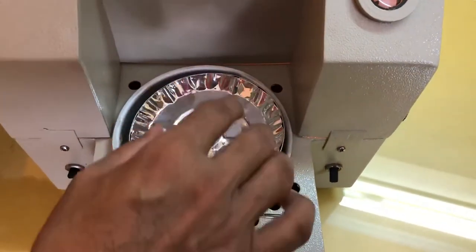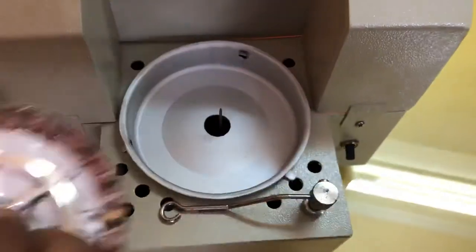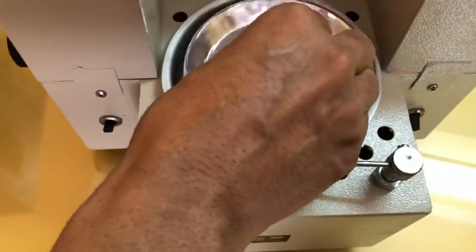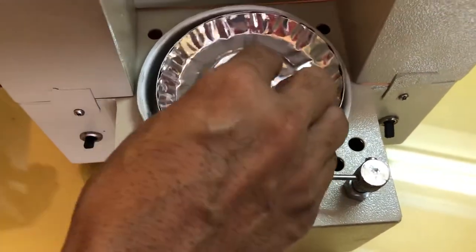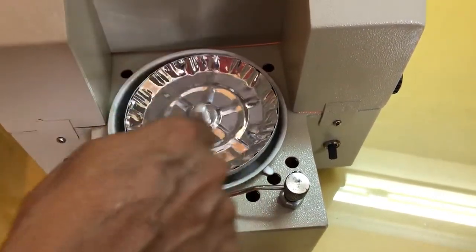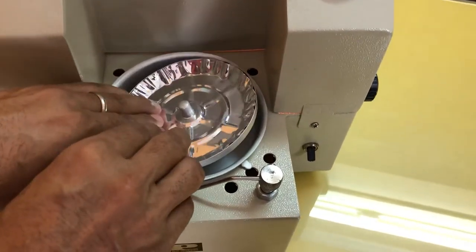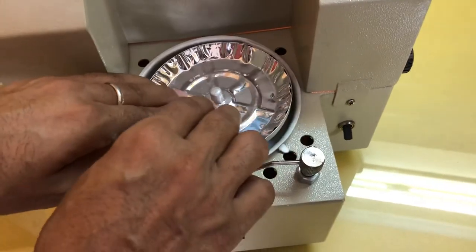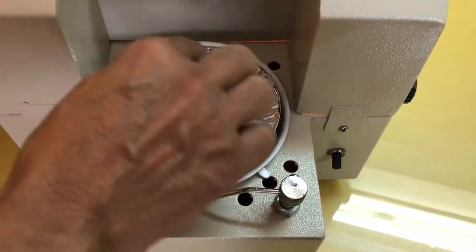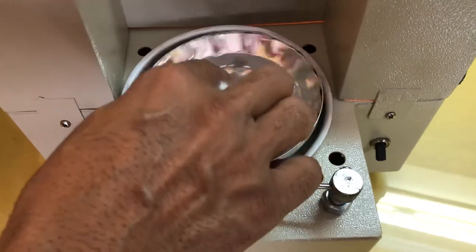Now we have to place the sample on the sample pan. There is a way how to place the sample. As you can see, this is a small pointer on which the sample pan is held. What we have to do — there is a method — we have to distribute sample all around this sample pan. If you keep it in a lump at one side, then this sample pan will not be free and will tilt. So we have to distribute the sample all around the center knob of the sample pan so that it remains in a horizontal position.